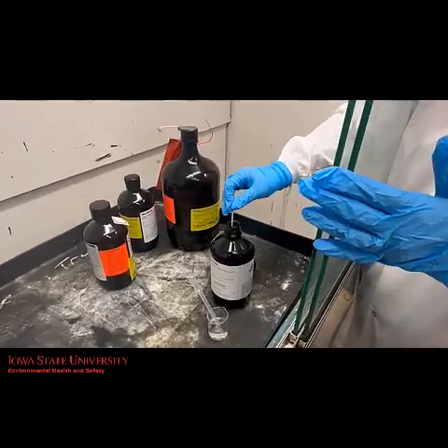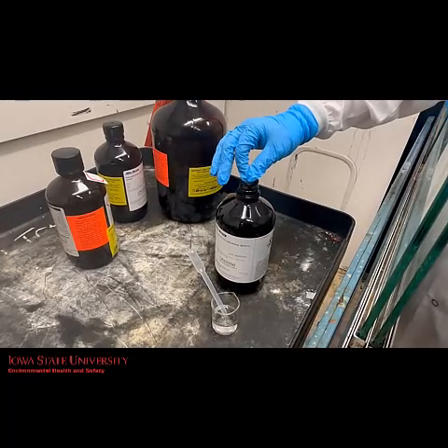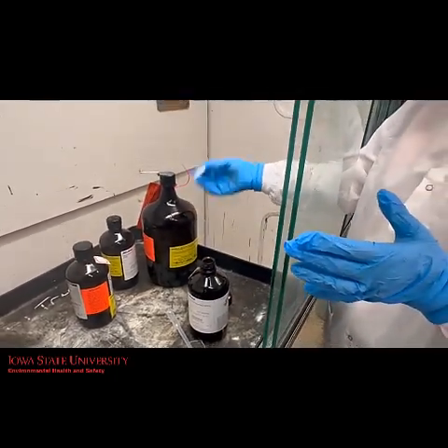We can dip the strip directly into the container because this is waste. If your test solution is not waste, you'll want to transfer a small amount to another container for testing to avoid potential contamination of the chemical.